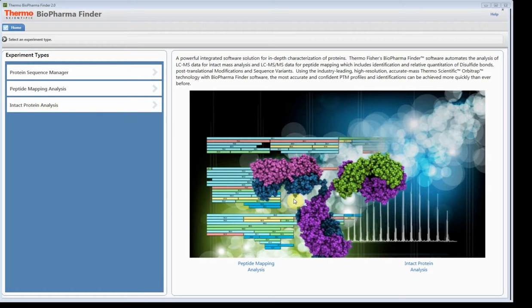Hello and welcome to the Biopharma Finder 2.0 example guide on how to process intact analysis. In this example, I'm going to demonstrate how to process some native raw files that were processed for the first septum molecule. There are going to be 10 different raw files, and I'm going to show you how we can do the raw comparison in the new software.